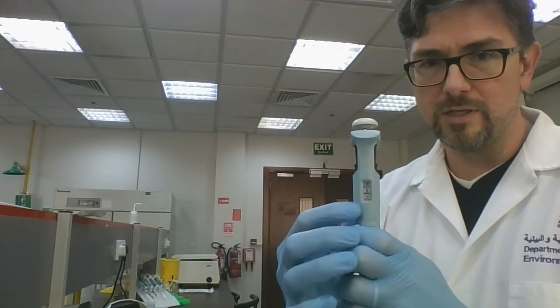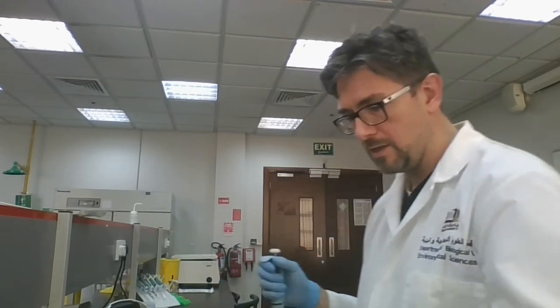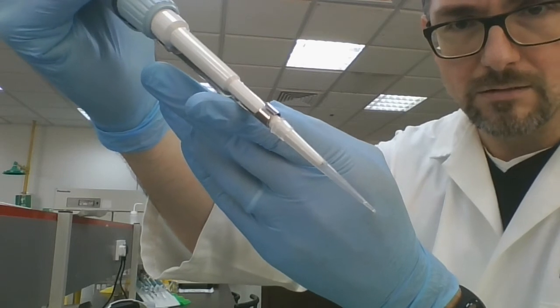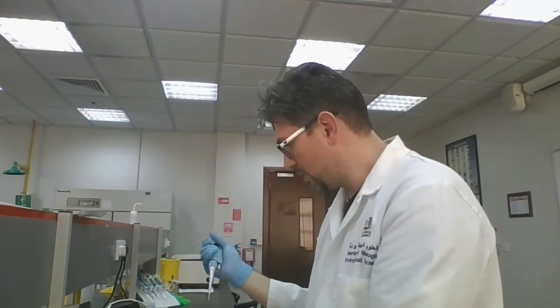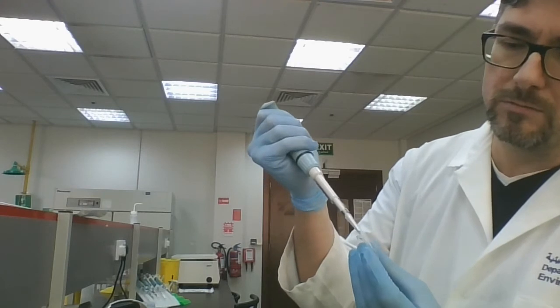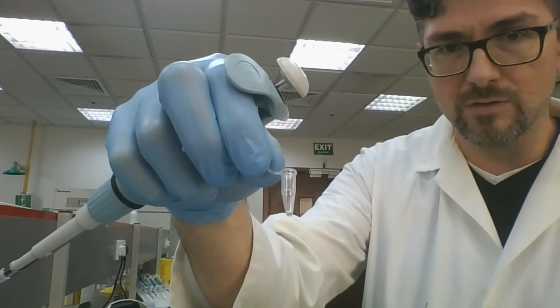Get your P20 and set it to 2 microliters — zero, zero, zero with the bottom zero as a decimal place. Put on your tip by tapping it down gently, then take up some sterile water. Two microliters is not much — there's a very tiny amount in the tip. Add that to tube number one along the sides of the tube, keeping droplets away from one another.